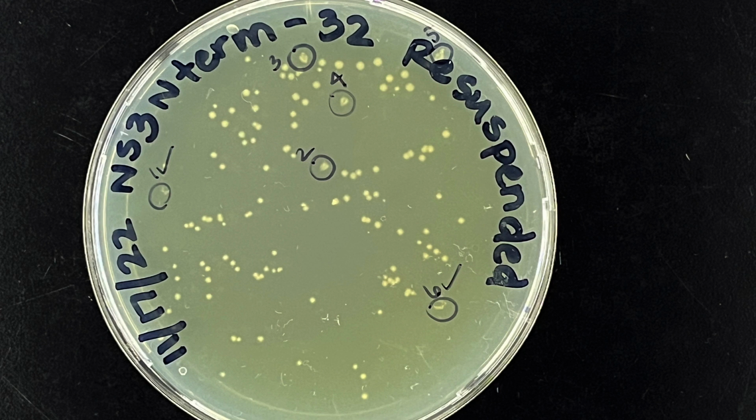And last one here, this was a gene that Ashley and Tiffany have cloned. Sometimes what we do is we actually pre-pick our colonies prior to picking them. So they've gone ahead and circled the colonies that they wanted to pick. And this way, when it comes down to actually picking the clones that you want, they've already kind of indicated the ones that they would like to get. And the benefit of doing this is that sometimes if you end up losing your grid plate or the clones that you have, you can simply incubate this plate longer, which is what they did here. And then the little scrape that you made on the plate will grow back into larger colonies. So you can recover the clones just in case you lose them.